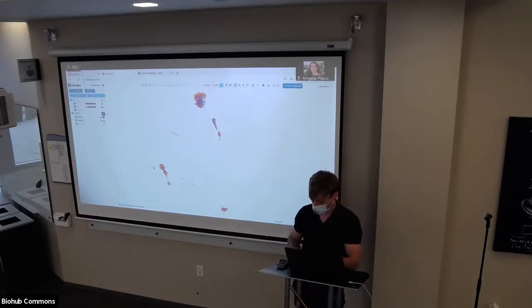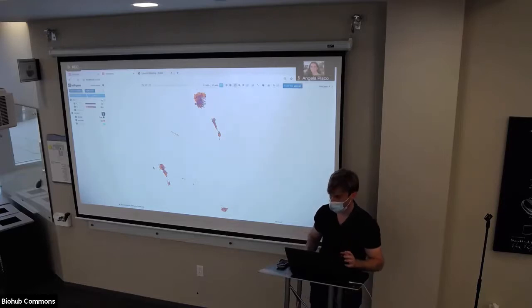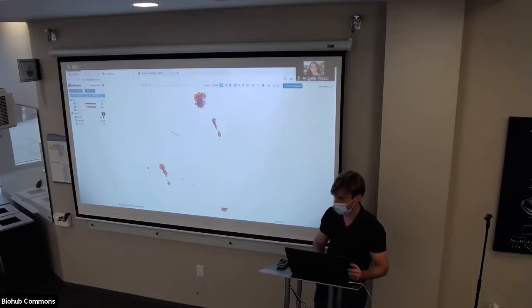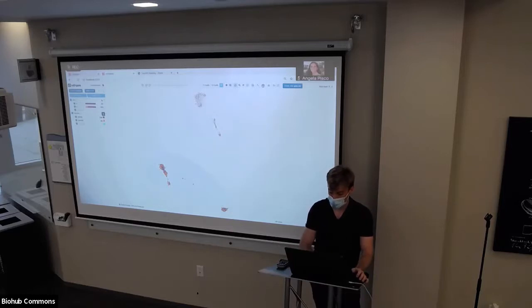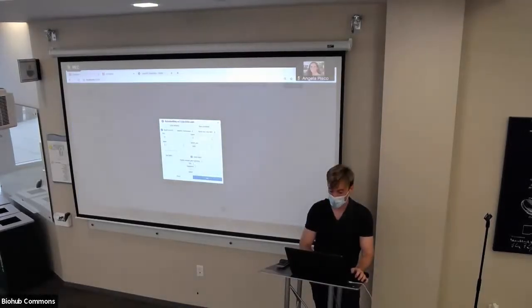So that is your first approach analysis, okay? The thing that is really, really powerful about this viewer, and my favorite feature, is the ability to subcluster. So how do you subcluster? It's really straightforward. You just select your cells via the lasso tool or categorical selection or brushable histograms. Then you click this plus button, and now you see you're re-embedding on 1,300 cells. So we'll just leave all the parameters the same, and we'll click run.